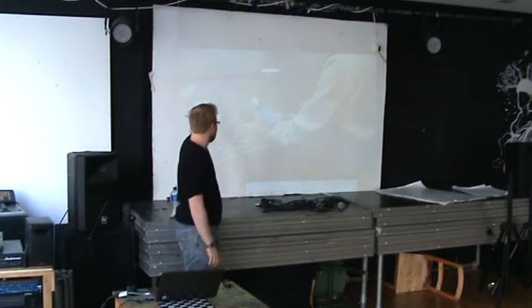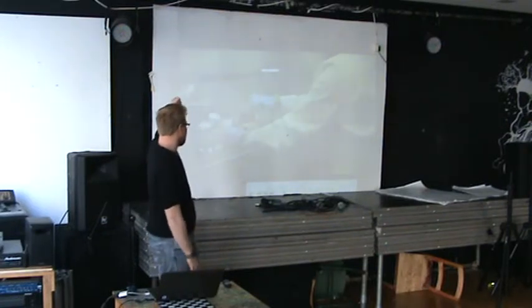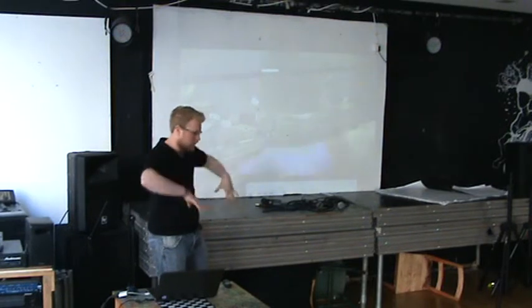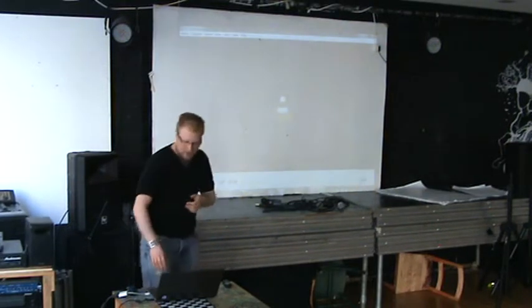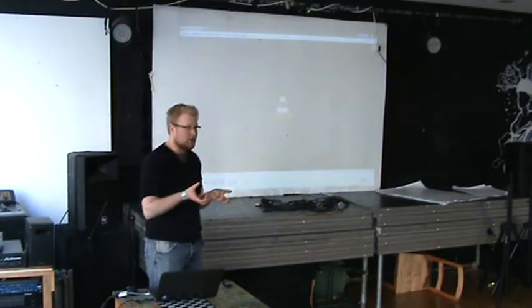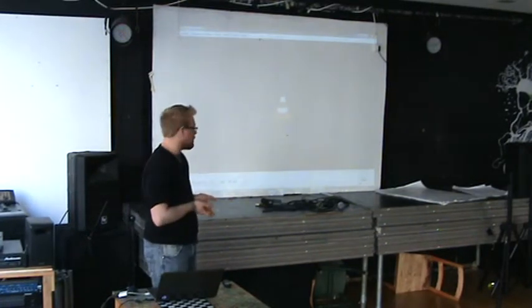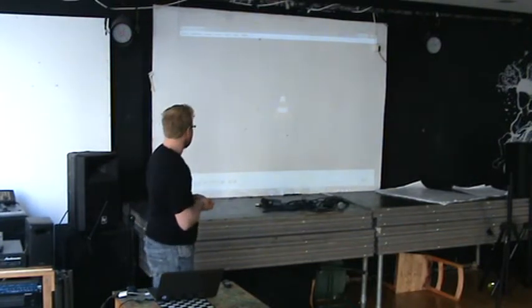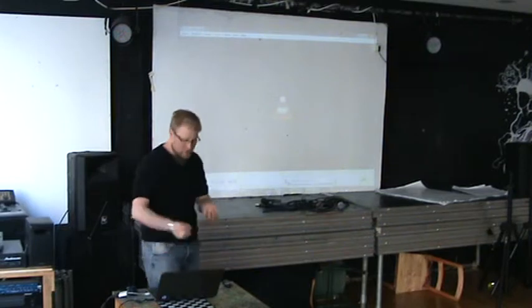So what she's doing now is putting them in a fume hood, or not a fume hood, a laminar flow cabinet. This is a sterile environment. The air is being pushed out and displaced, and you have to do everything sterilely with cells like these. Get anything in them, it's going to completely take over, especially if you don't have any antibiotics. And you just have to be really careful.